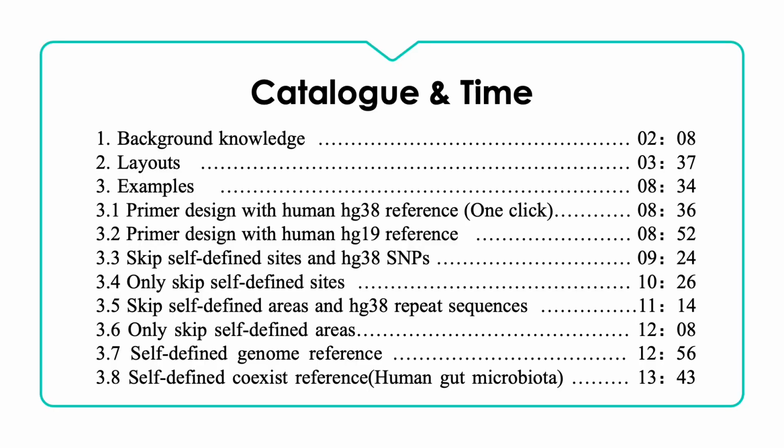To save time, you can pause here and choose the chapters of this catalog you're interested in. However, if you don't understand functions in some chapters, you may need to check those skipped chapters. Basic functions are listed in the earlier chapters.